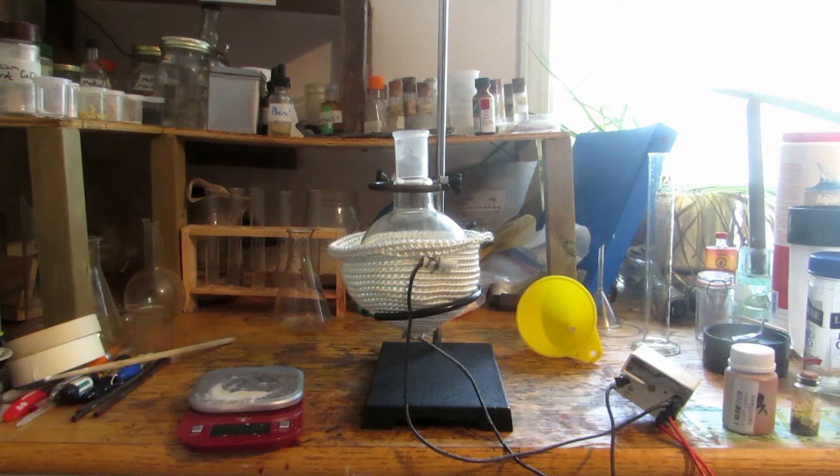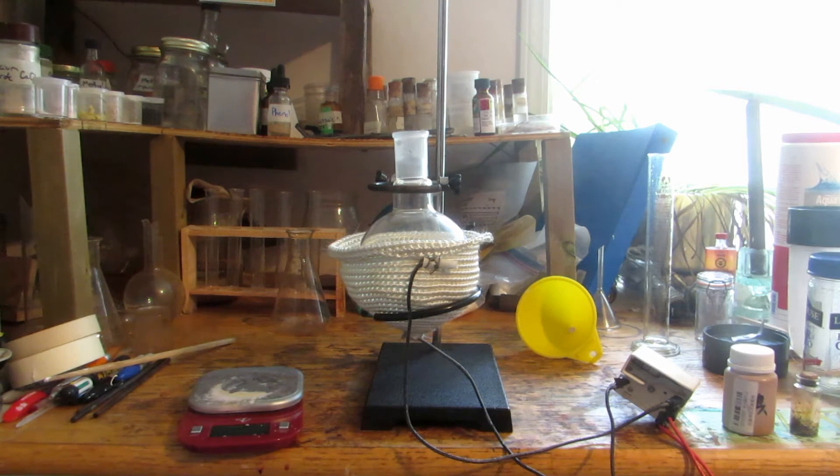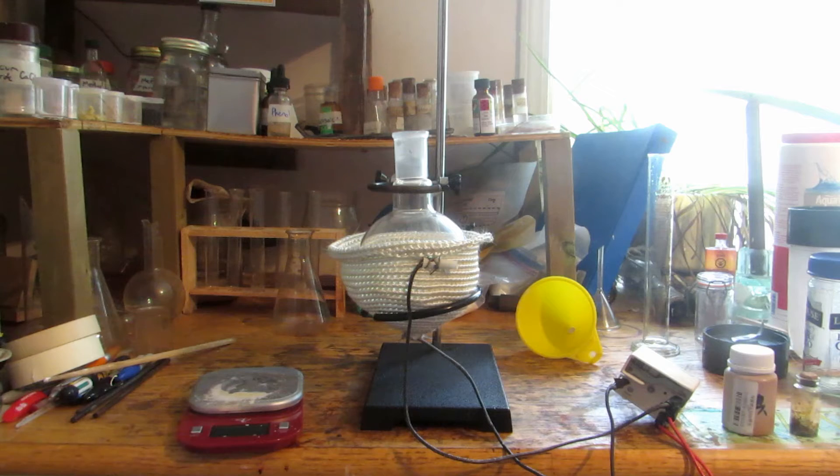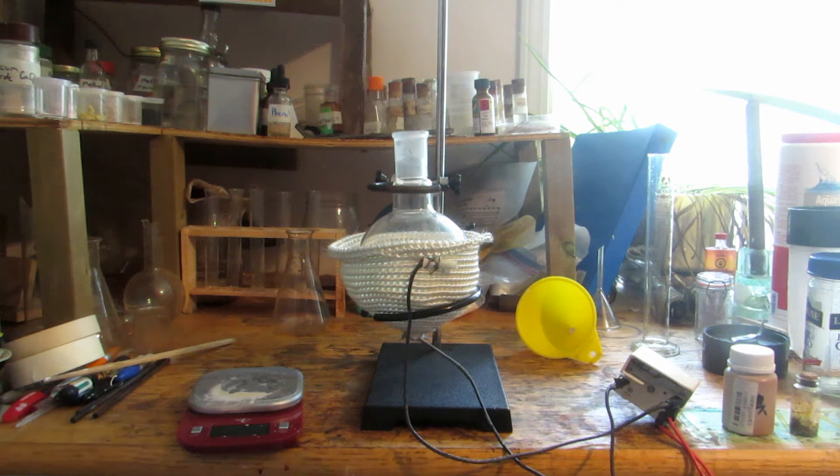When that's been added, the flask was swirled to dissolve it. Now I've turned on the heating mantle because we need to get this solution quite hot, probably around 70, 80 or 90 degrees Celsius for the reaction to occur.